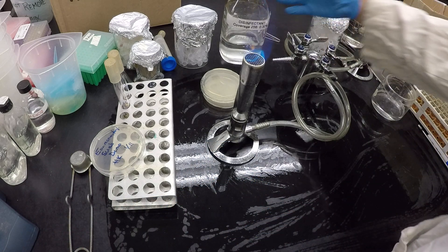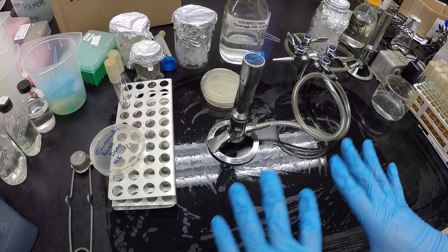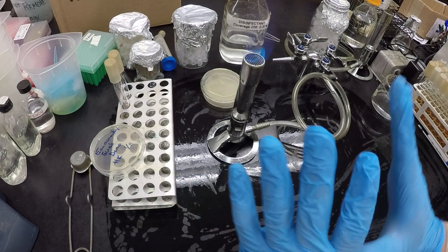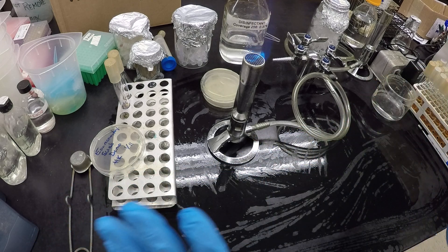Of course, we are not bacteria-free. Even with all this work, you can still introduce contamination, but it's the best that we can do for what we have.